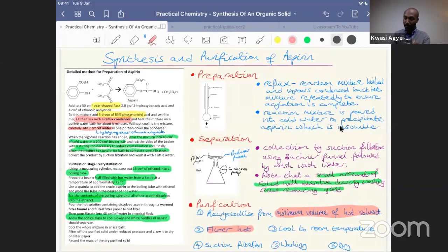So as I gave an example there, grit perhaps. And then we want to cool slowly to room temperature. Very important. The slower you cool down to room temperature, the better quality crystals you get. Okay, so you don't want to stick your hot solution into an ice bath to cool things a bit faster, because what you then get is poorer quality crystals.